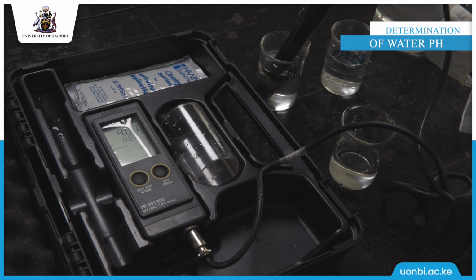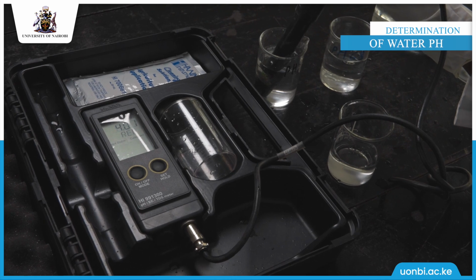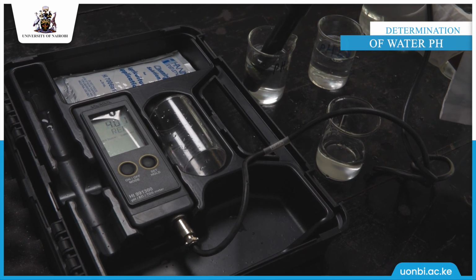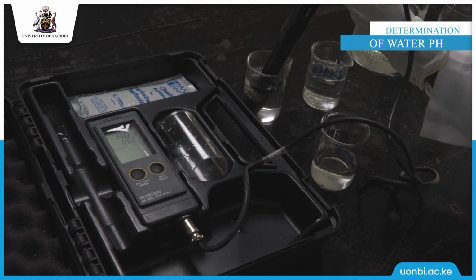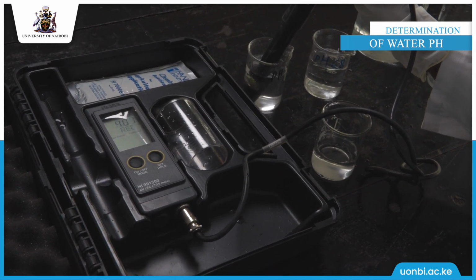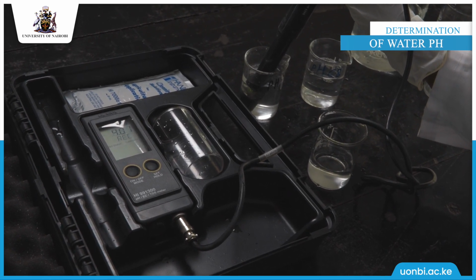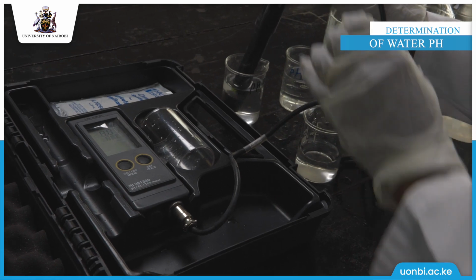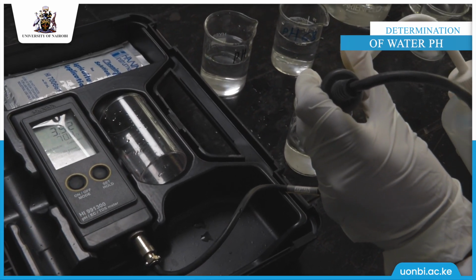You're waiting for the reading to stabilize. The reading has already stabilized, and now the electrode is ready to take the measurement for the sample.